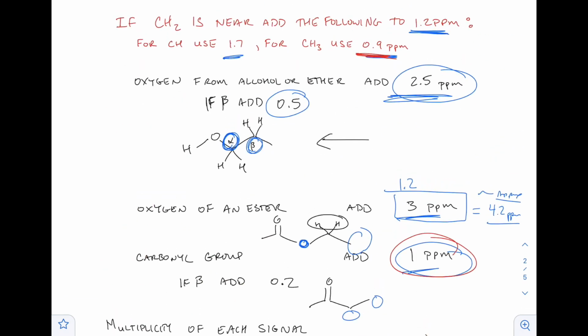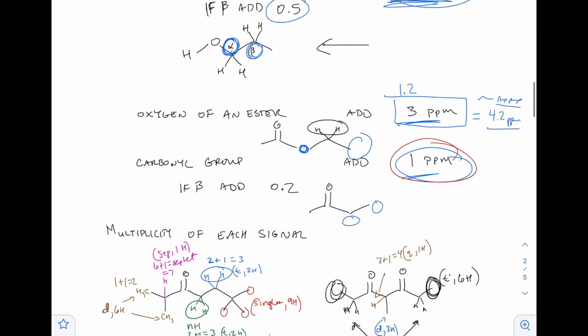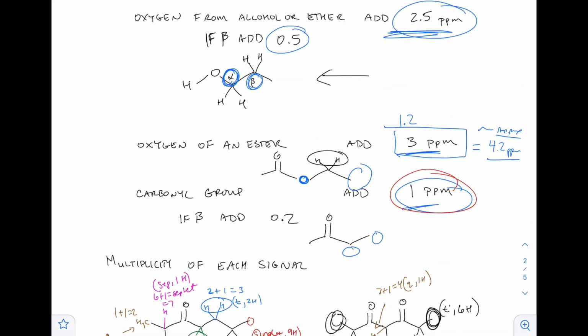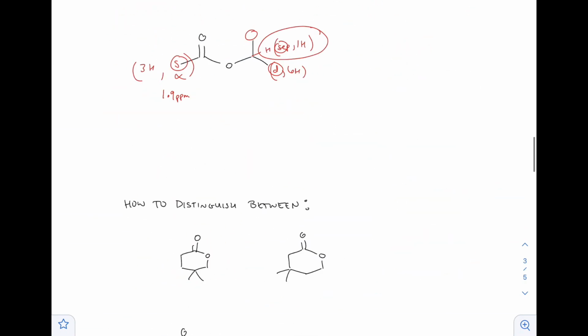The CH starts at 1.7 for our baseline, and that was, how far was that from the carbon? That's an ester, right? Coming off of that carbon adjacent to it, and so we're going to add 3 to the 1.7. So that's 4.7, approximately, right? I'm going to put approximately because this is not set in stone at all. Don't think that it is.